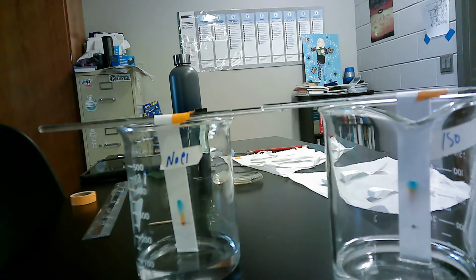It's not a fast process. It's kind of slow, but you can see how they look different depending upon the different solvent. Again, the one on the right is the isopropyl alcohol. This is the sodium chloride. So think about the differences between an alcohol and a sodium chloride. Sodium chloride is ionic, whereas isopropyl alcohol is a covalent compound but has hydrogen bonding in it. So that difference will be important in why they do what they do.